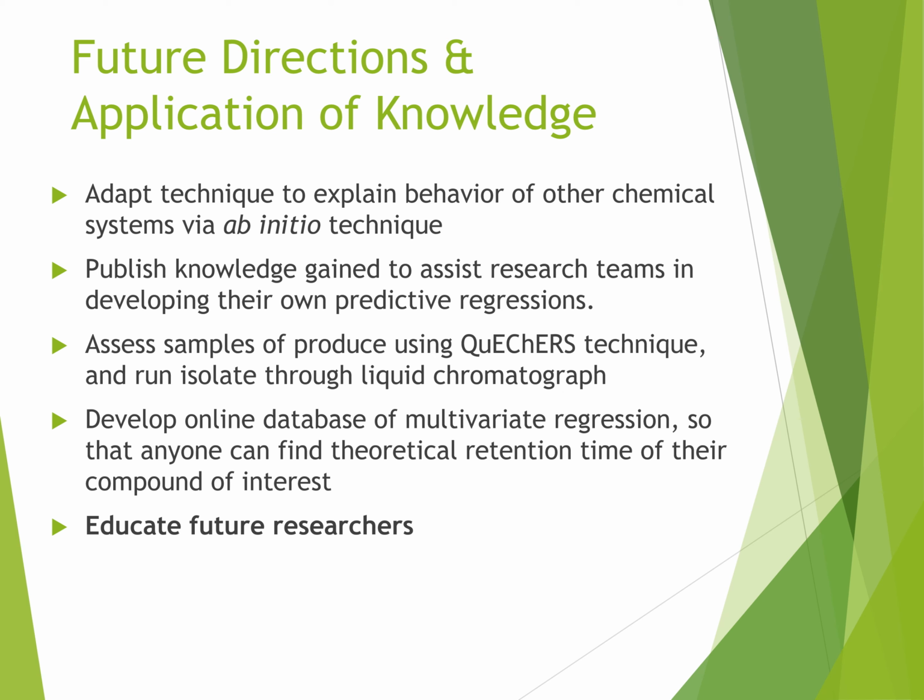We would like to develop a procedure to identify and quantify pesticide residual load on food samples local to us. We will develop an online database of our multivariate regressions so that anyone can find theoretical retention time of their compound of interest. We will be educating future researchers on this technology and this technique for research.